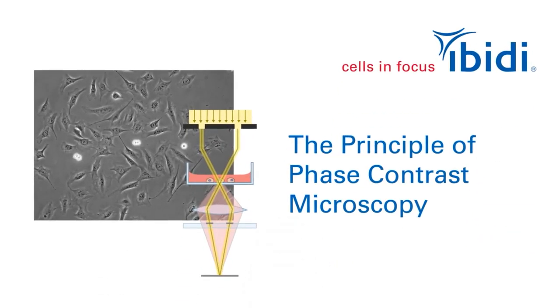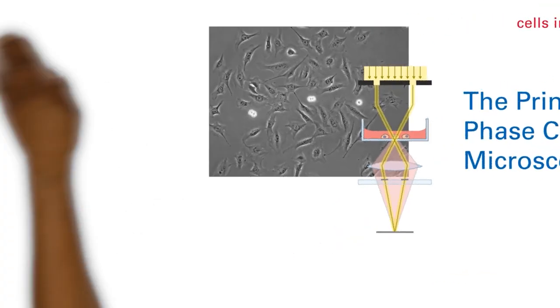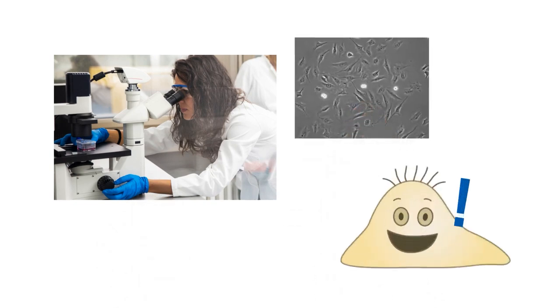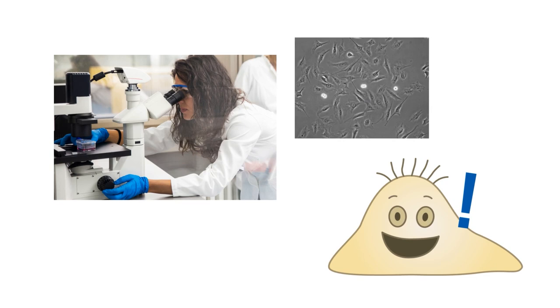The principle of phase contrast microscopy. Simply explained. Do you often use phase contrast microscopy to check your cells? This video will give you a simple explanation of how it works.